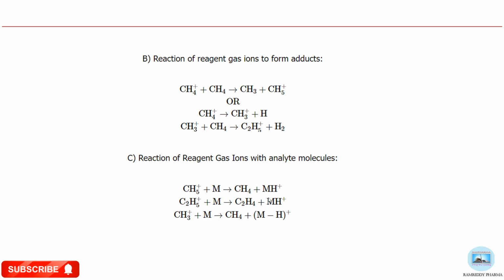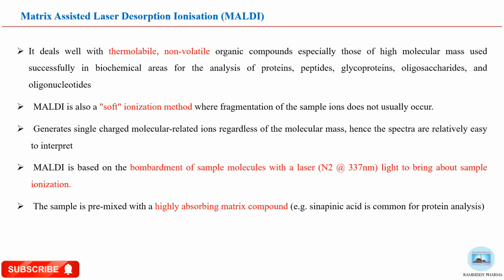So that's why we are calling it a soft ionization technique. The next one is matrix assisted laser desorption ionization, or MALDI. This technique is mainly used for thermolabile and non-volatile organic compounds, like proteins, peptides and glycoproteins. This is also one type of soft ionization technique.